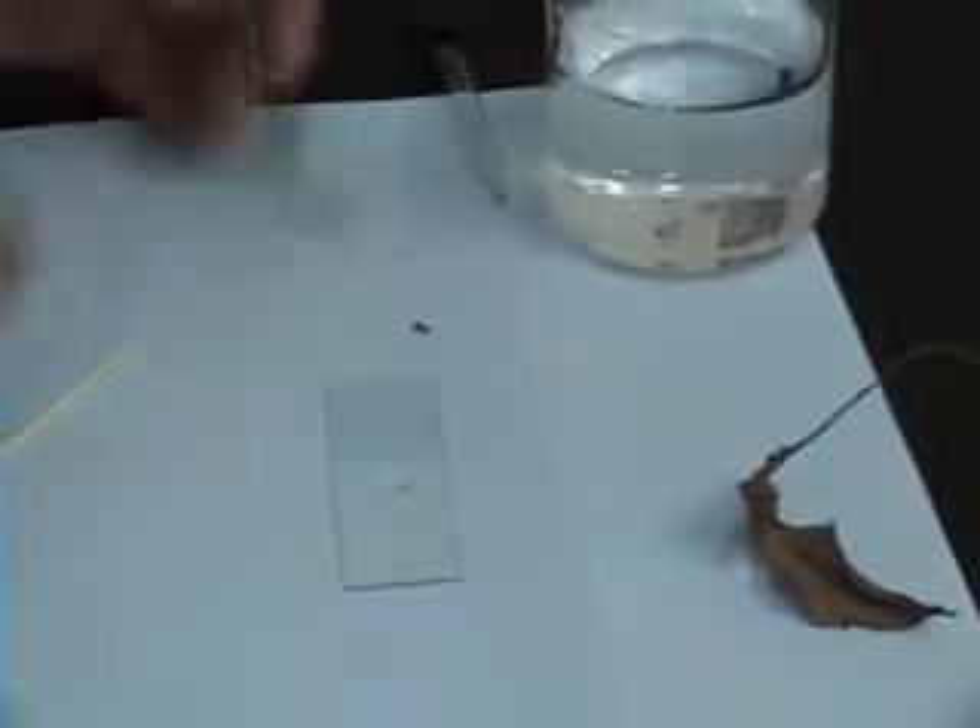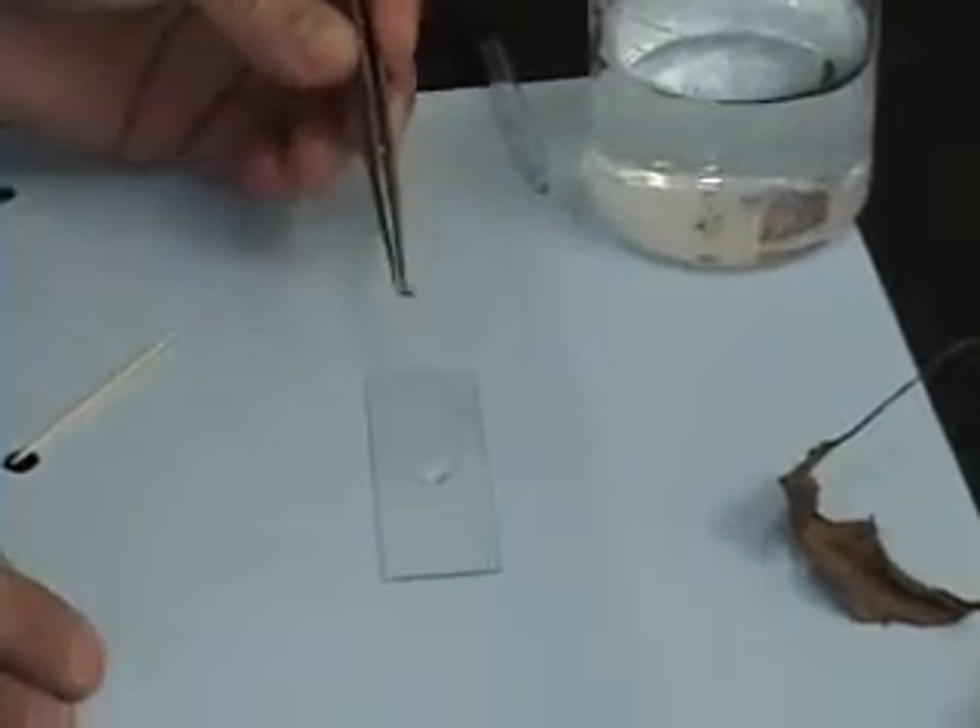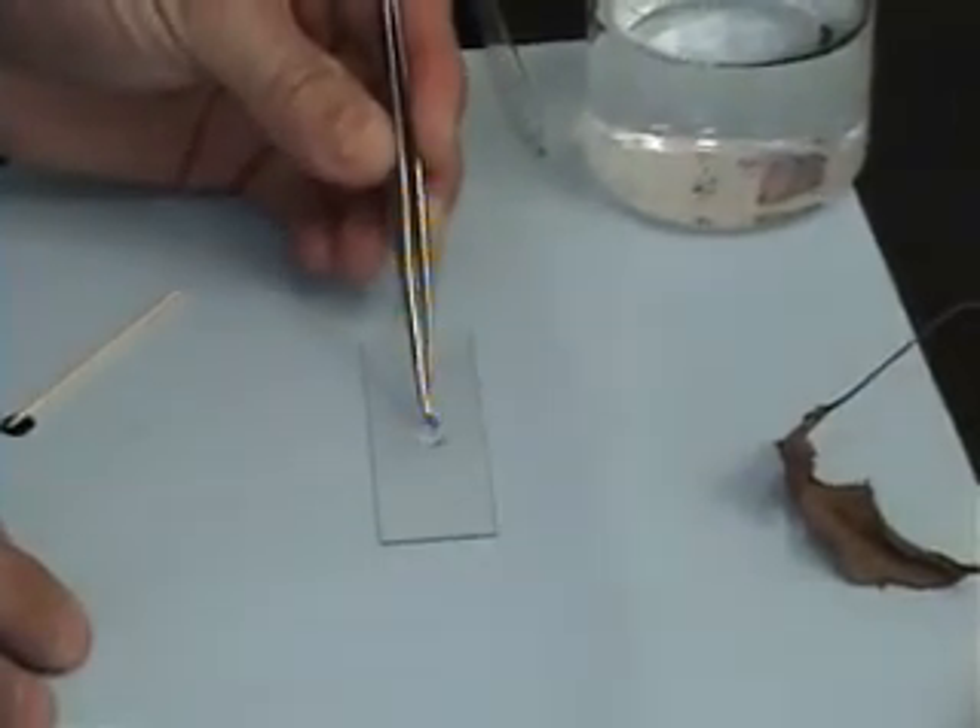Next, using your tweezers, you would take your specimen and drop it in the middle of your drop of water.